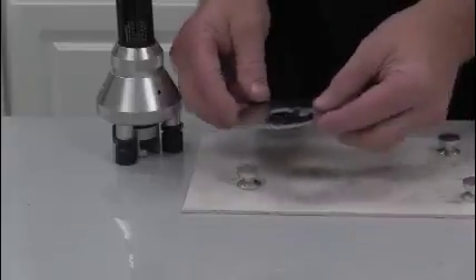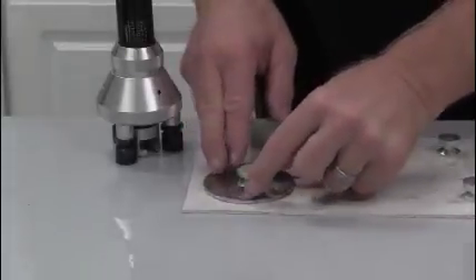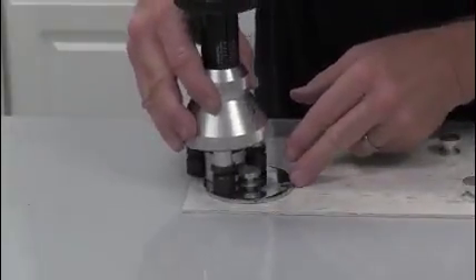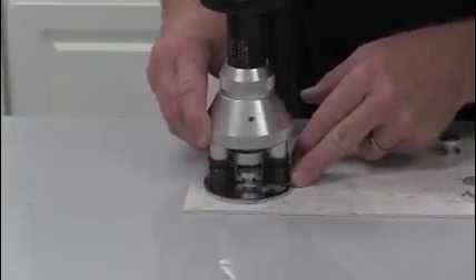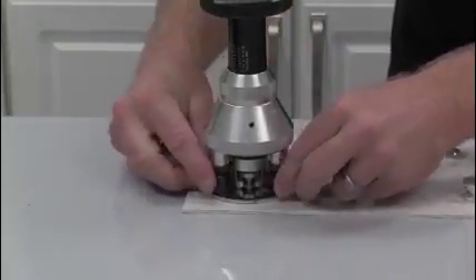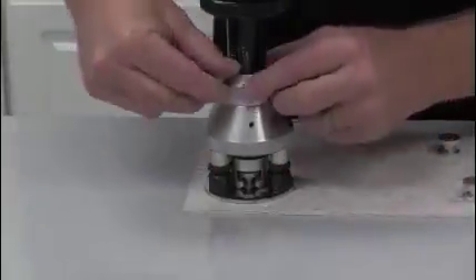Now we're going to place this ring around the dolly. The purpose of this is just to distribute the force equally. We're going to slide these jaws in, making sure not to disturb the dolly as we get it in there. The other key thing is to make sure the feet are all nice and level before you start your pull.